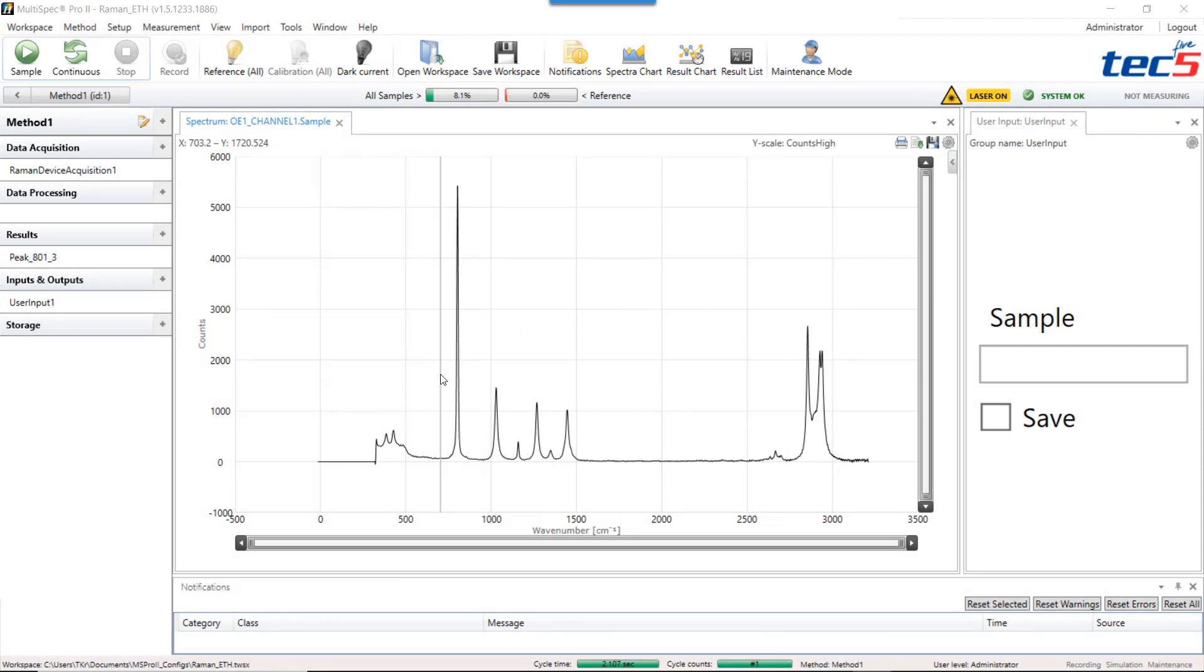Hello, today I'd like to show you how to use Result Method Steps Storage with Multispec Port 2.